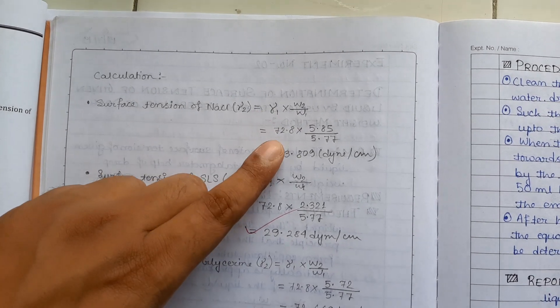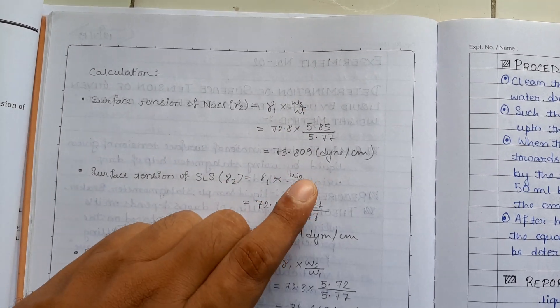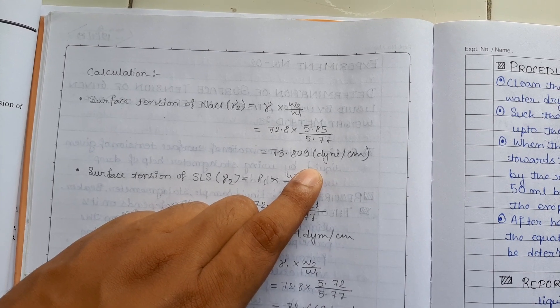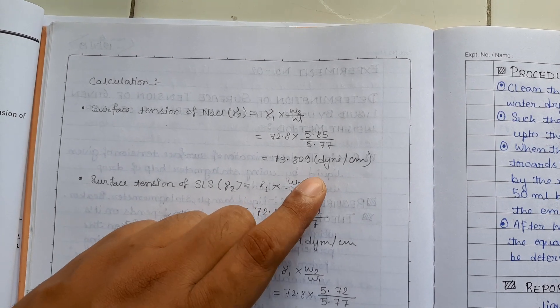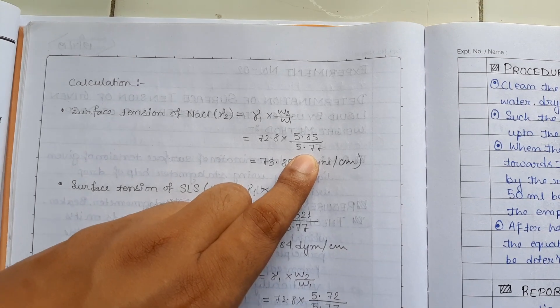Gamma 1, that means the surface tension of water, 72.8. W2, that is the weight of liquid that you got from upper mark to lower mark by using stalagmometer. And W1, that is the weight of water, distilled water, reference liquid.